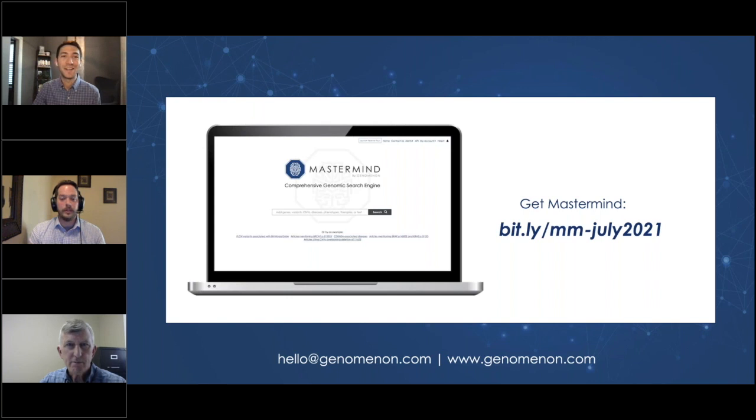That seems pretty obvious to me, but I'd like to hear if you have any cleanup or enhancement to my answer. The user interface allows you to search flexibly for any variant, but we also enable the Boolean or multi-parametric capability to search on multiple variants at once, though I would recommend in your workflow that be relegated to compound heterozygous cases. Whether they're in the same gene or in a different gene, if you've got a case with multiple variants, that's how I would recommend executing your search in the user interface.